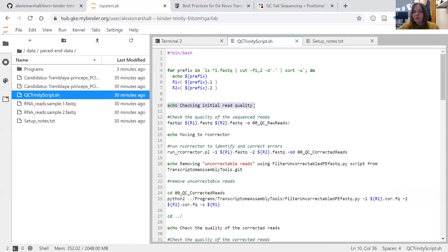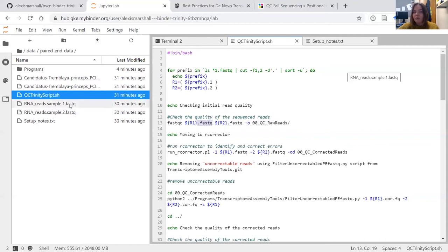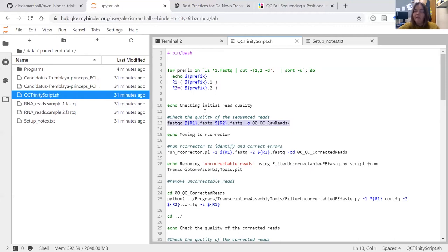This script sends some things to screen as it runs so we can see which step it's up to. It starts by running FastQC on read one and read two. The file has '.fastq' at the end, and that's what enables the terminal to identify the particular file. It outputs to the folder called 'raw reads' created during the setup note step. This gives us a starting point for the quality of our sequence reads, which is important so we can track how each following step impacts the original read quality.